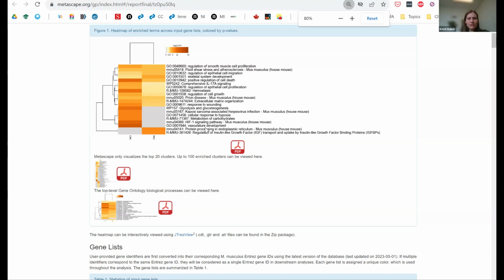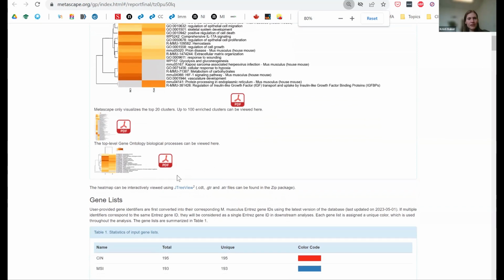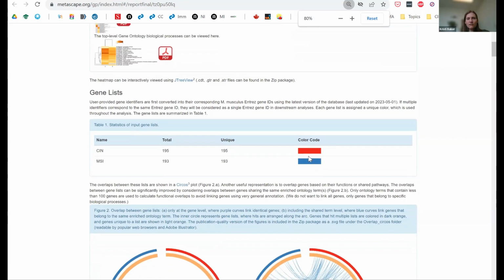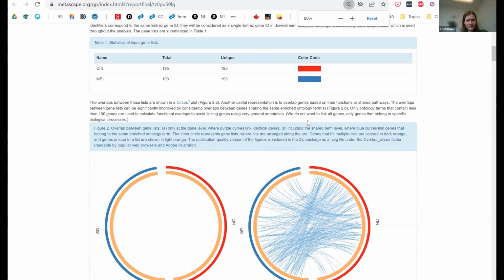different conditions versus different. It only puts 20 in the default one, but you can see here, if you want the one that's got 100, you basically just click on this button here and you get the one that has 100. Again, you can download the individual images, or you can export all as compressed, and you get all of this. It's giving you here a color coding. So keep in mind that this color coding is going to apply to the next graphs that we're looking at.